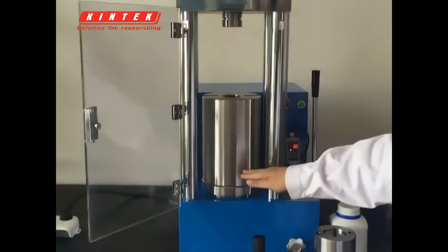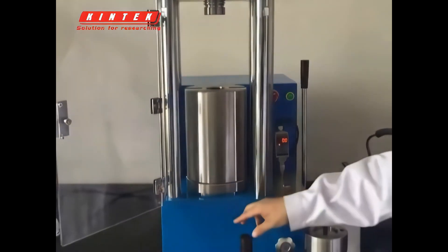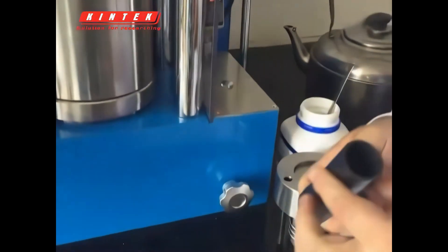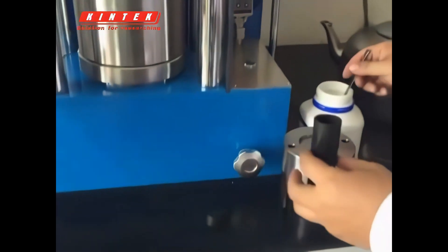Maximum formation is 50. Now let's get a sample. This is a rubber mold. First we put the sample into the mold.